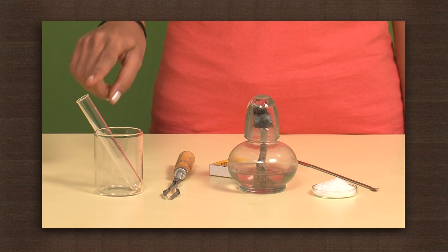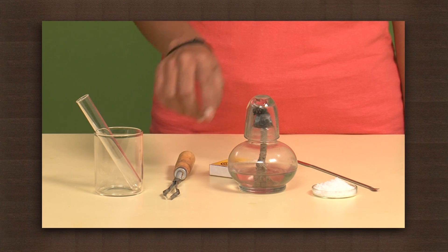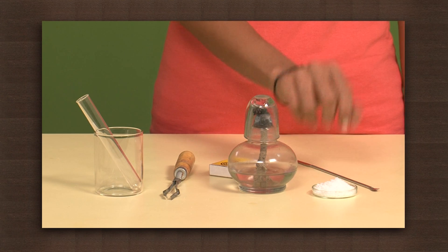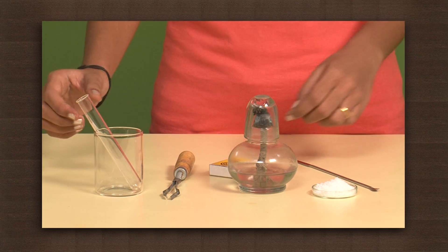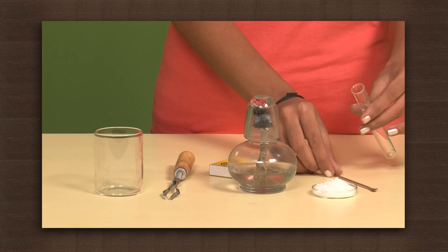Here we have a test tube, test tube holder, spirit lamp, and lead nitrate. Take some lead nitrate in the test tube.